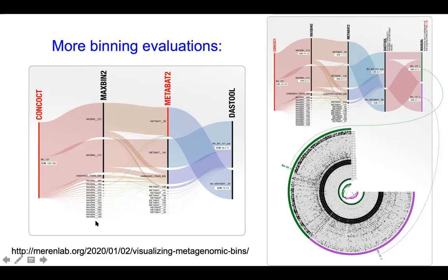And then there's a whole lot of contigs that are either not binned or in different bins, in the case of MaxBin. MetaBAT does something analogous, but says, no, there's 3 bins. And there's a bunch of small components that get placed in different bins.